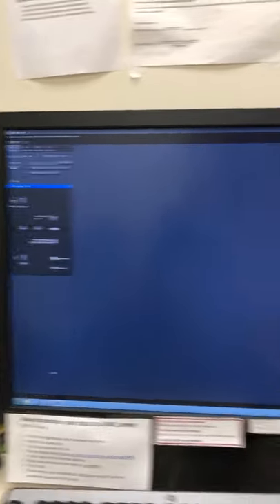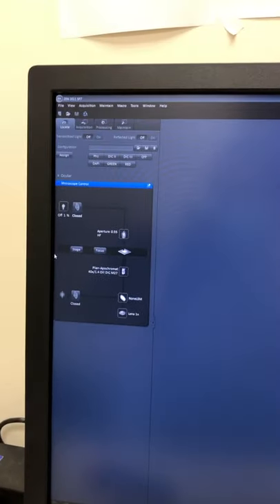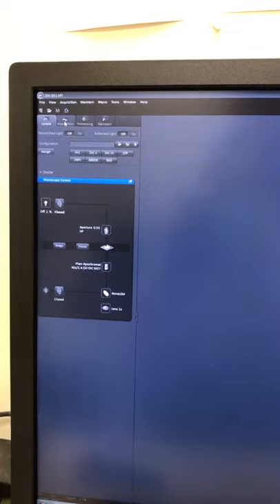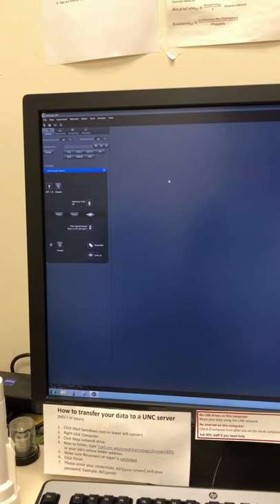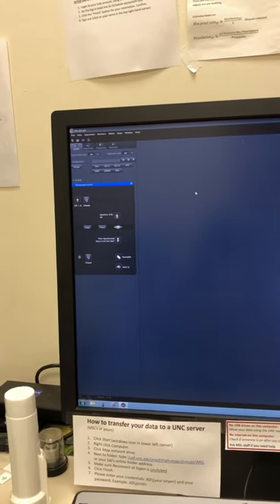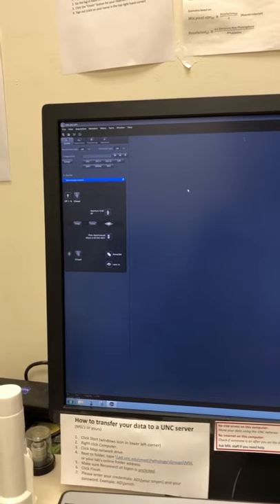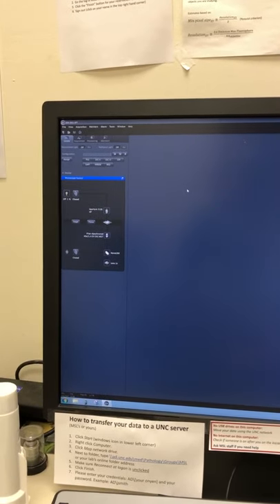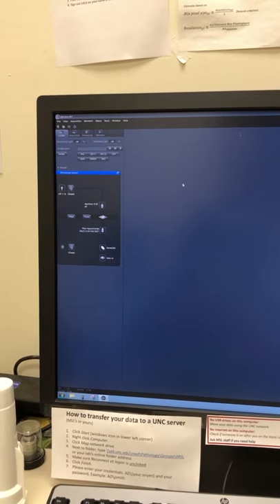The system has now started up completely. You can see there's a locate tab and an acquisition tab. I have another video that discusses the LSM 700 where I go into detail on how to use those. For now, let me just show you one thing that's a little bit different on the 710, which is the sample holder for the stage.